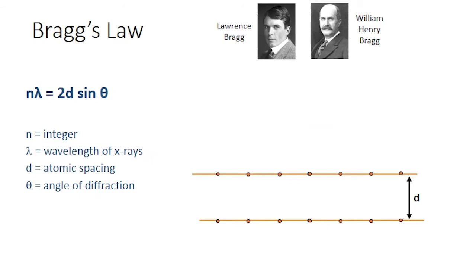So to begin our discussion, we need to talk about Bragg's law. Bragg's law was developed by Lawrence Bragg and his father, William Henry Bragg, and it really defines the X-ray diffraction condition. So let's talk about the terms in this equation.